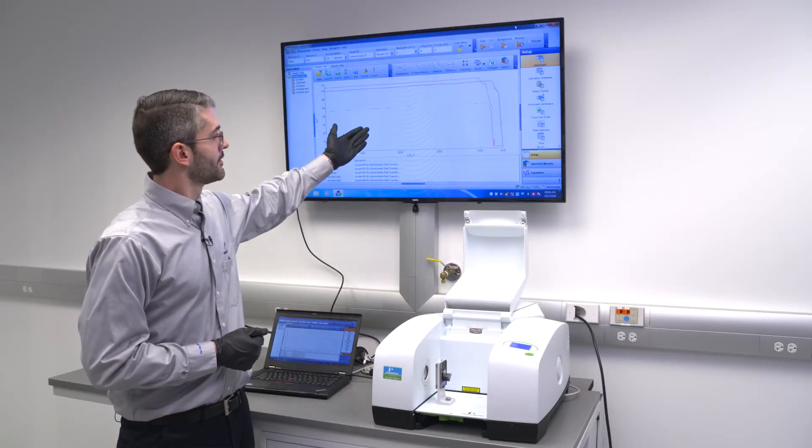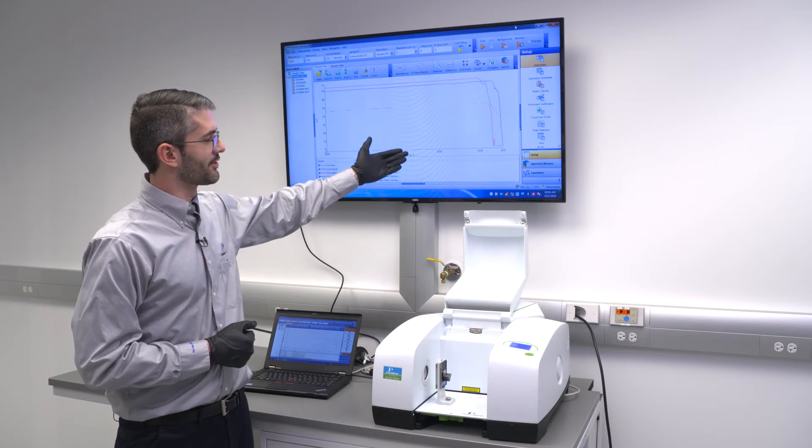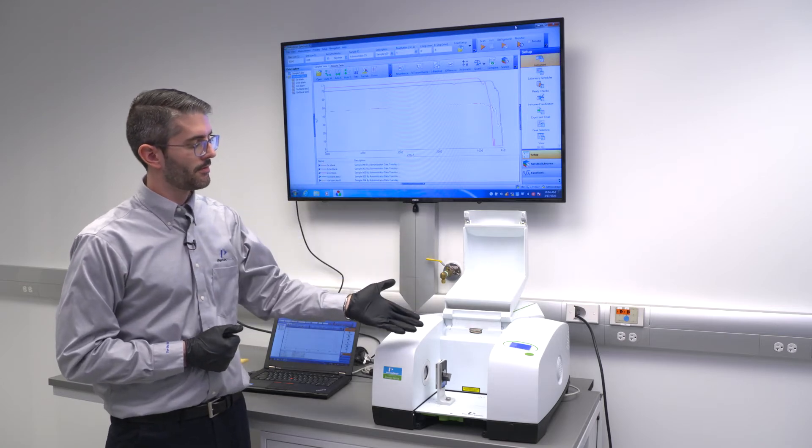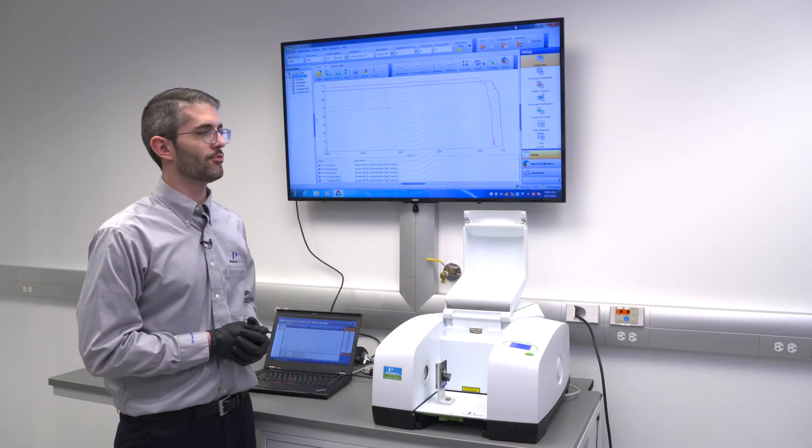Looking at the spectrum here, you'll notice we performed the measurement with the sample compartment open. This allows atmospheric water vapor and CO2 to enter the infrared beam path, which would cause the appearance of spectral features associated with those two vapors in the infrared spectrum.